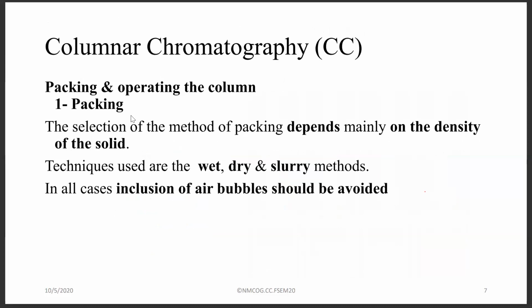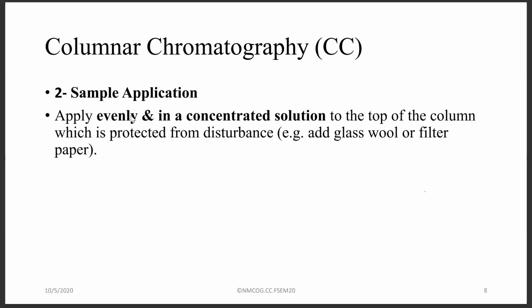So the different things that we need to look at, we need to look at the packing. One of the methods that we use to decide on the packing material is the density, or one of the factors. Some techniques may use wet, dry, or slurry methods, and we should always avoid air bubbles while inserting the packing material.